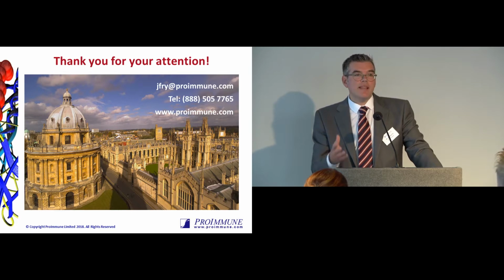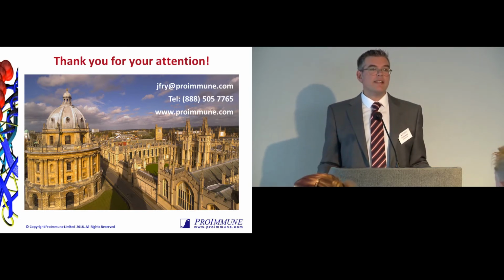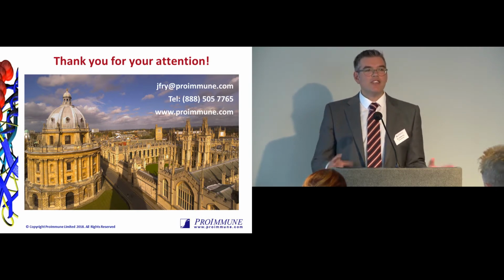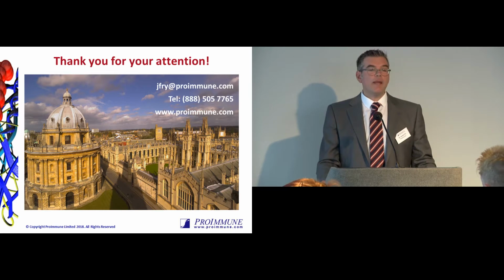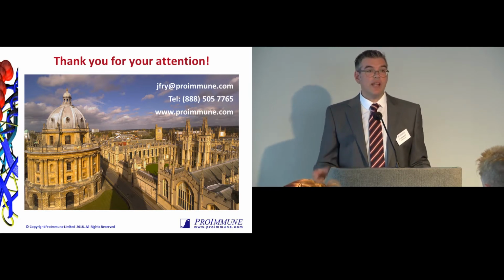So if we take that assay as an example, it's a reasonably high concentration of the protein, but part of the reason for that is it's an artificial system at the end of the day. We're obviously working with monocyte-derived DCs rather than plasmacytoid DCs. We're really trying to skew the system to be able to identify the peptides that are actually being presented. So we want to use a concentration of protein which is obviously going to enable you to do that. There are dose responses.